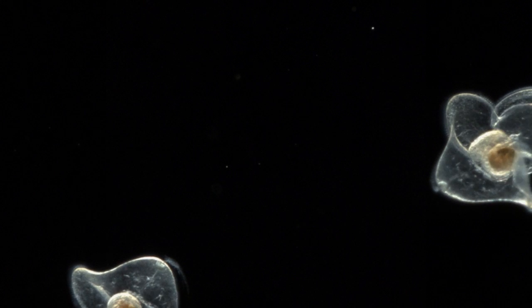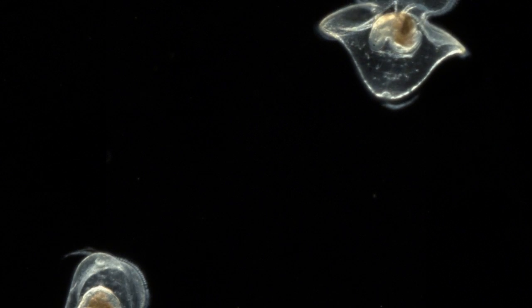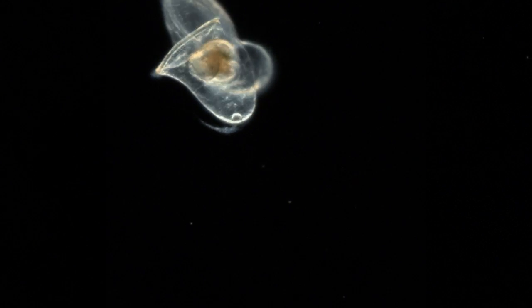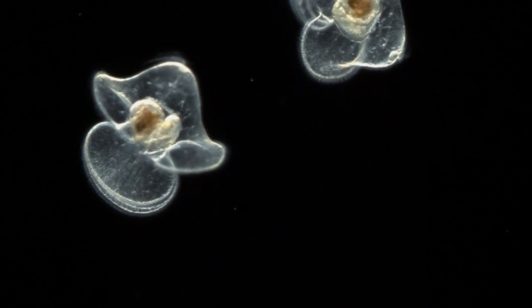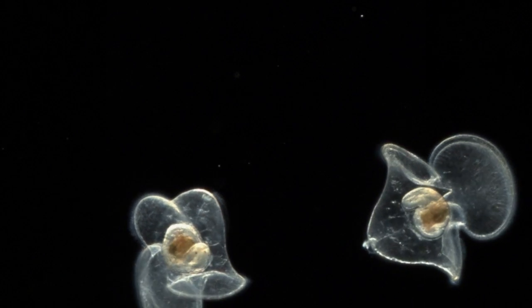This is the iconic nemertean larva called the pilidium. It looks like a hat with ear flaps. The ear flaps are called the lapets. There are also two lobes, and you can see a ciliated band spanning the lobes and lapets, an apical tuft at the anterior end, and inside the pilidium you can see its gut, which is this dark brown area, and a little juvenile worm riding around inside. Nemertean larvae range in size from about 100 microns to over a millimeter, but most of them are fairly small.